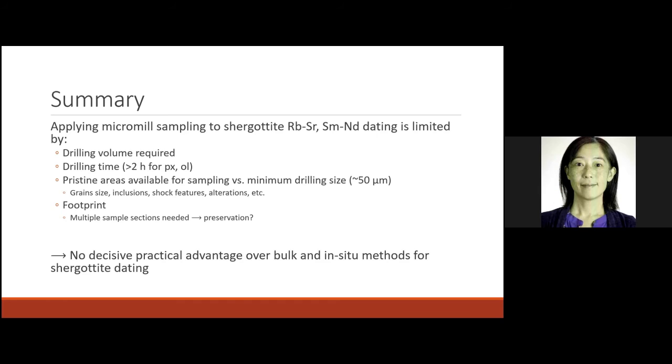I have a comment on that. So I have two questions. One is how you determine the depth. When you determine the surface of the section, you know where you're hitting, but how deep are you drilling? How do you avoid accidentally hitting different phases?